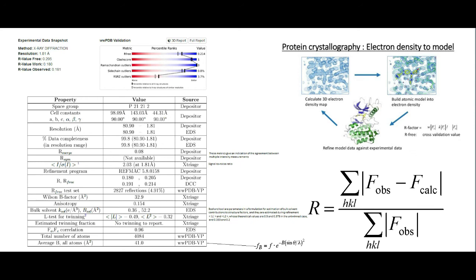This shows it going over here, but what you would actually do is go here and then do real space alignments, trying to fit your atoms into the electron density. And what you're doing in the real space alignments is trying to fit it into the electron density while also maintaining the bond angles, bond lengths, allowed rotamers and things like that.